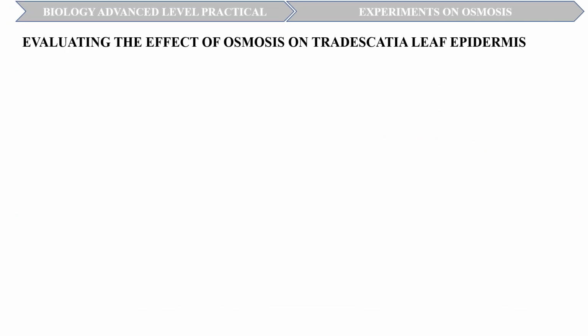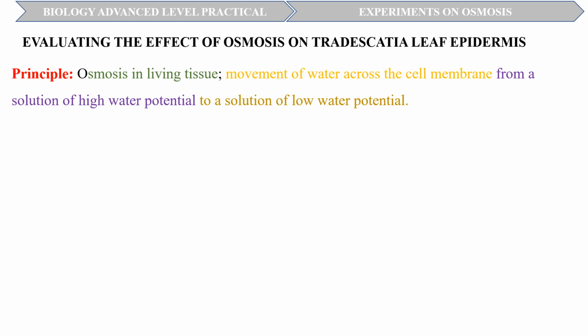This experiment is based on osmosis in living tissue. As a reminder, osmosis is the movement of water across the cell membrane from a solution of high water potential to a solution of low water potential.